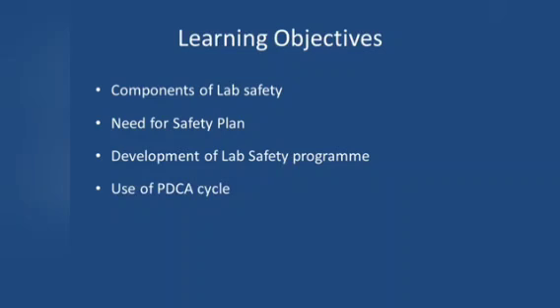Why do we need a safety program? How do we develop one? And the use of the PDCA cycle in developing the safety program.